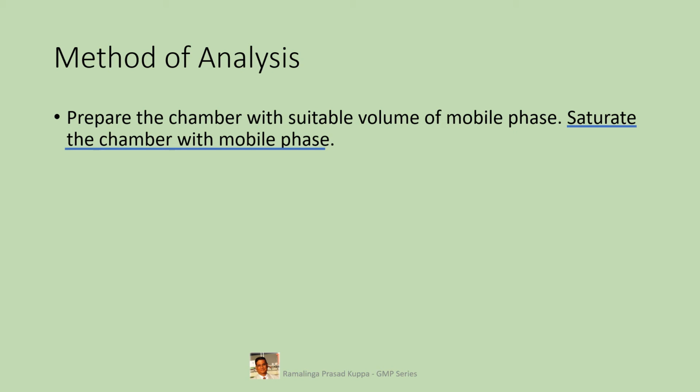For this, a suitable size of filter paper impregnated with mobile phase mixture spray should dress at least 2 inner sides of the chamber. But make sure that the filter paper is cut exactly to fit the sides of the chamber. It should not touch the TLC plate inside the chamber during analysis. The mobile phase evaporating from the paper saturates the chamber's air, so it does not dry the mobile phase off the stationary phase as quickly.